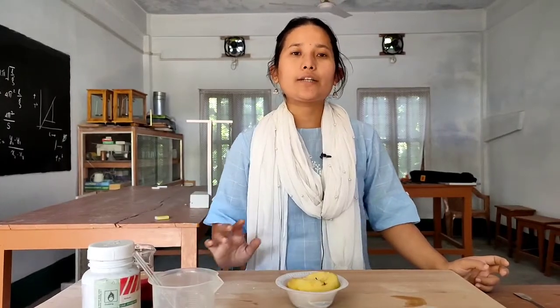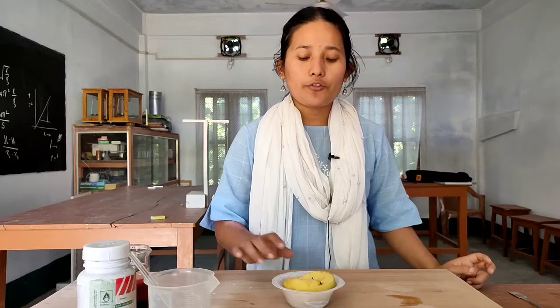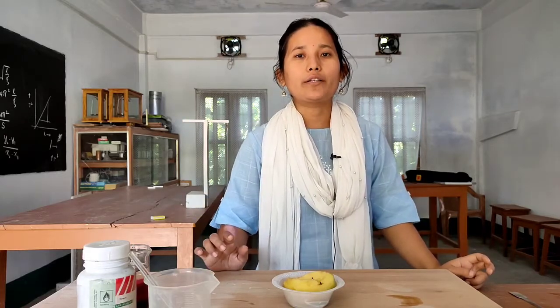So let's keep this setup for a while. After 2 hours we will again record the level of water here in this potato.